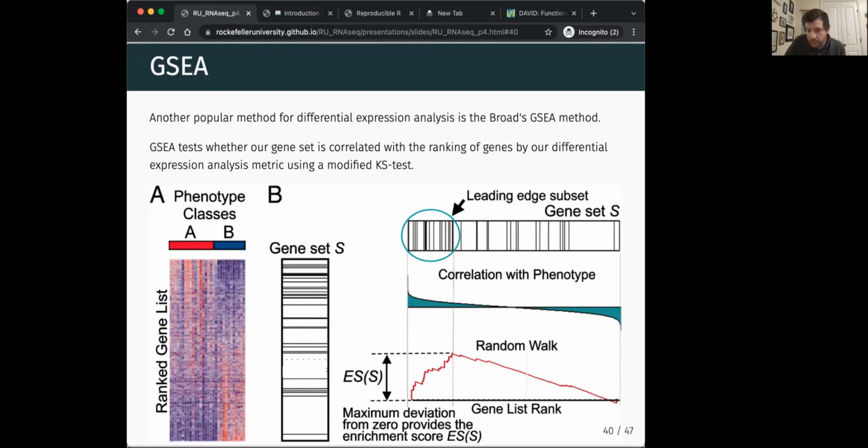And then a follow-up to the cluster question, but do you pull all clustered together or pass in as individual groups? So the way that it works, if you just put everything together into one analysis, then it would just be your entire experiment, right? And so you wouldn't be able to look for enrichment in a specific group.